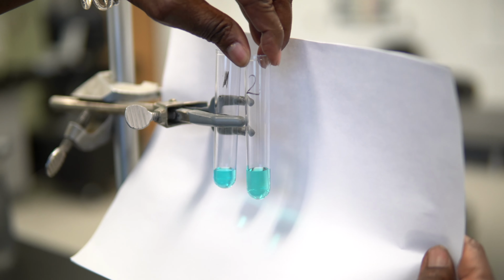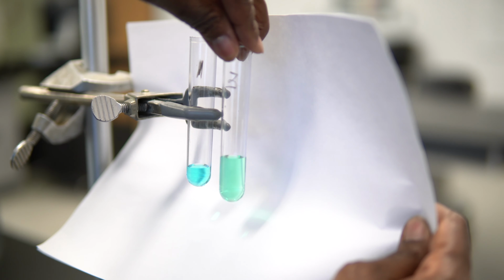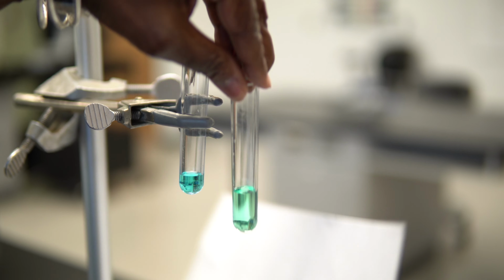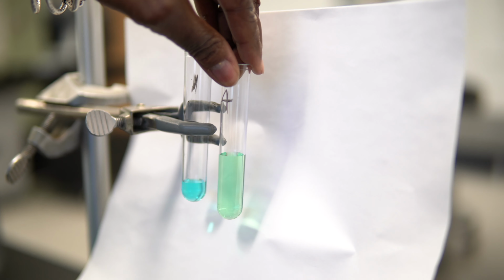Compare the colors of the solutions in test tubes 2 through 5 to that of test tube number 1. Use white paper as a background to assist with the view and the color comparisons. Take a photo of the 5 solutions. Record the colors in the appropriate columns in the data table.